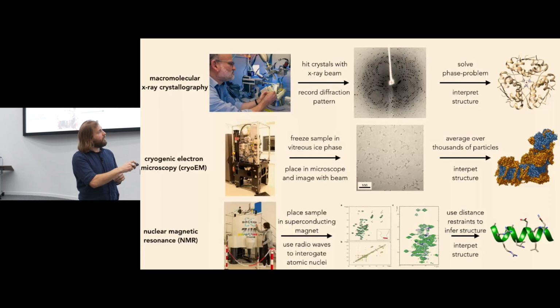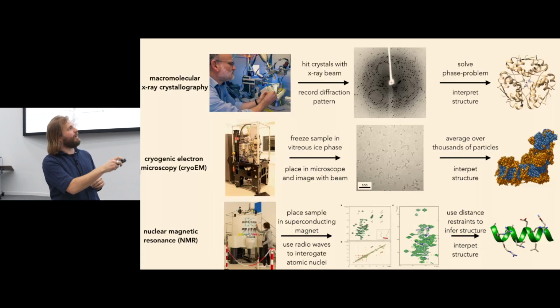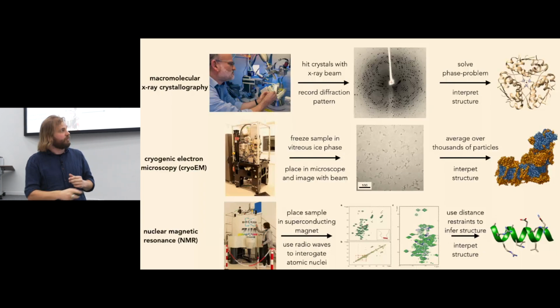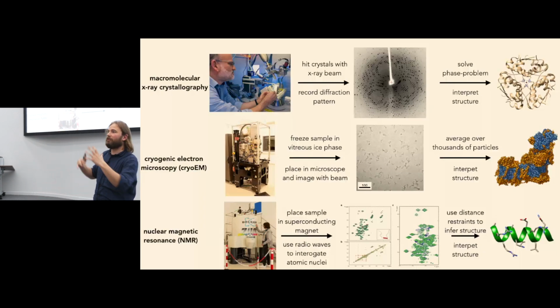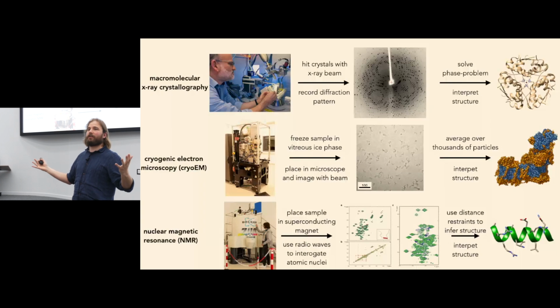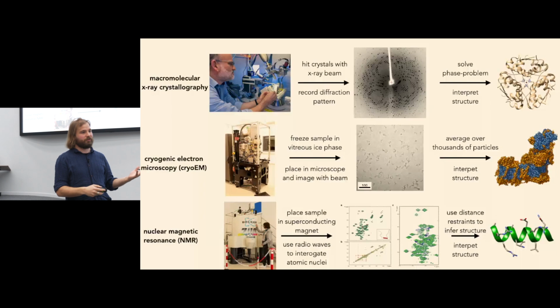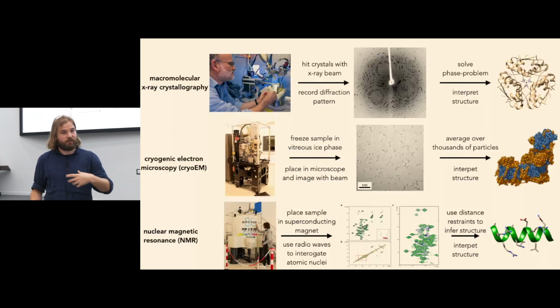The other sort of personal observation you have is, of course, that these patterns that you get in X-ray crystals, they're pretty inscrutable. They look very complex. You don't really know what that means without a very detailed analysis. Same with NMR. With EM, you think, oh, fantastic, we're using electrons rather than light, but at least we're now getting normal images. But if you actually start digging into the contrast formation mechanisms in a microscope, they're rather deceptive, and you start digging into contrast transfer functions and all sorts of very advanced maths to do high-resolution reconstructions.